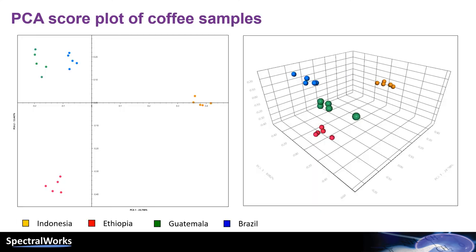From the results matrix, we are able to visualise the PCA score plot of the coffee samples. Using the category information we entered when we created the sequence, it is pretty clear that the data falls into four distinct categories.